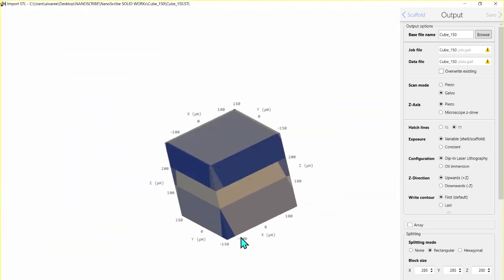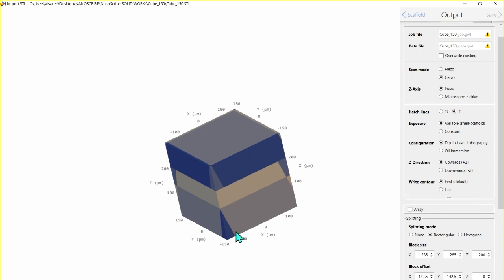It should be the size of one of the blocks because 300 is enough. So let's look into that, why is this happening and why is it dividing my structure in different blocks, because each block will cover the area of the printing field, okay?